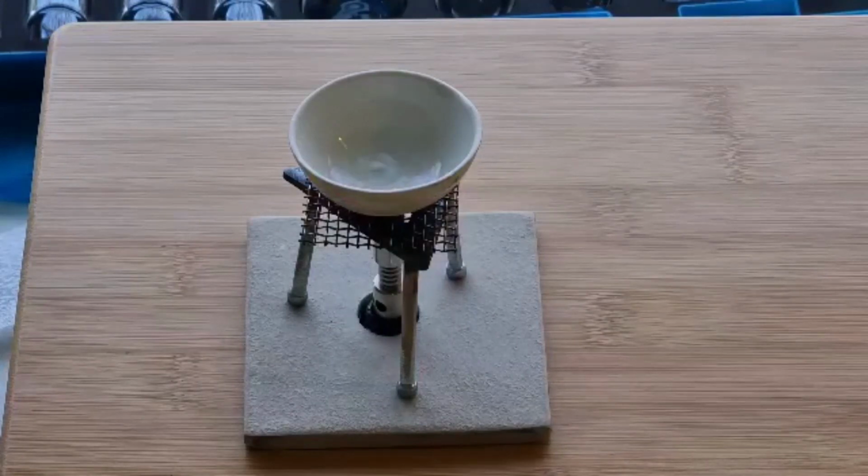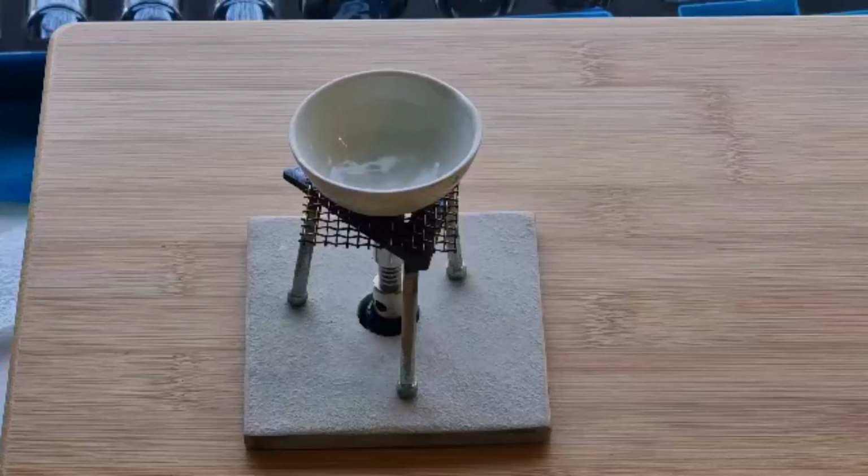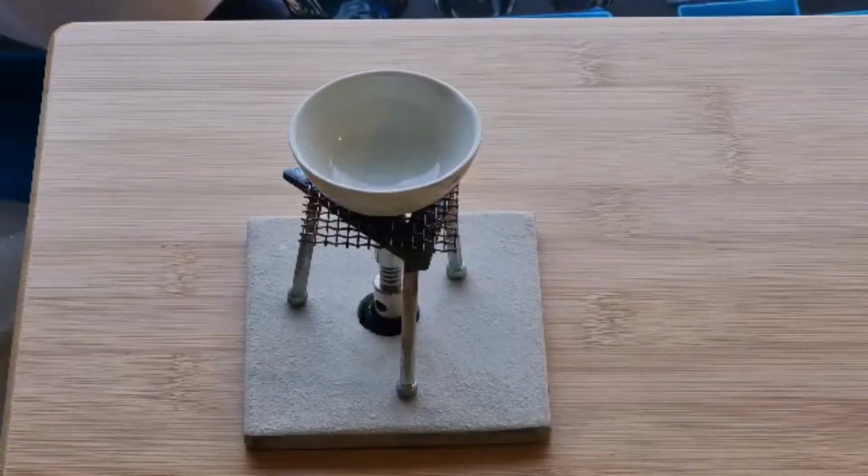One of the tricks associated with gravimetric analysis is because we want some precise measurements, we do not want to lose any of our salt out of the evaporating basin. So you can use a water bath for this, but you can also keep an eye on it and turn the heat down when you're getting a bit close.